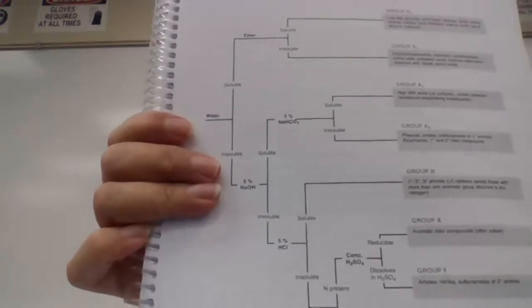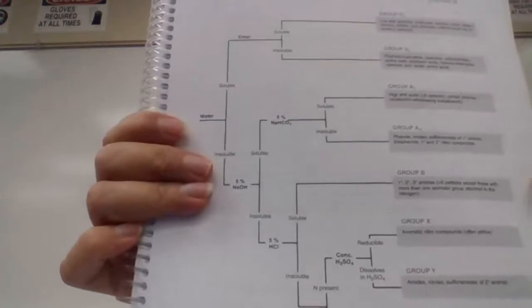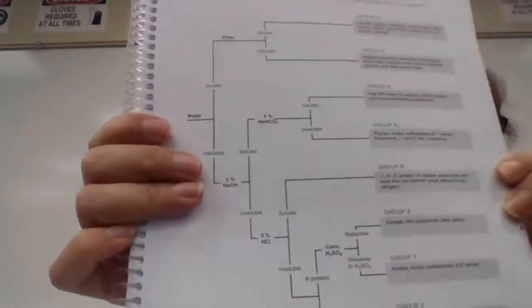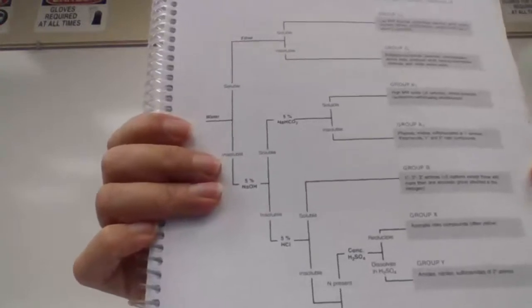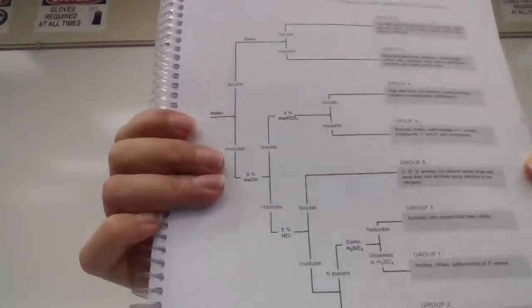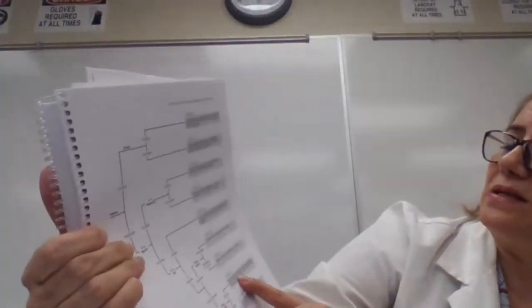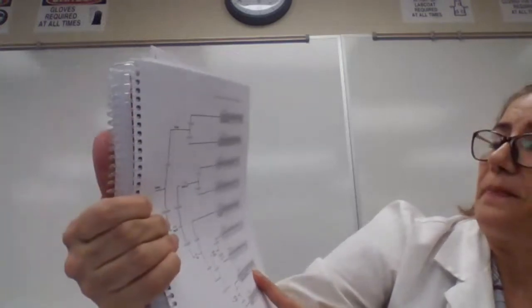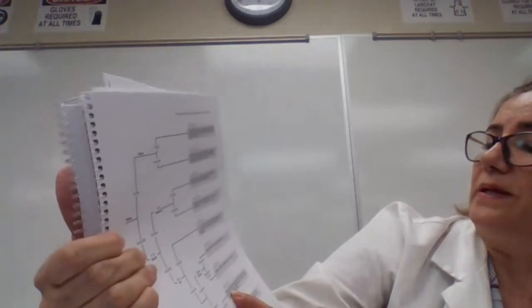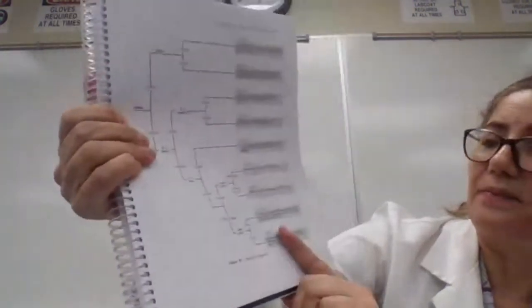So when it dissolves in sulfuric acid, that could be an alkene, an alkyne, a high molecular weight alcohol, a high molecular weight aldehyde, a high molecular weight ketone, and everything else in this box that says soluble. So it could be an ester, an ether, or any polar compound containing oxygen.